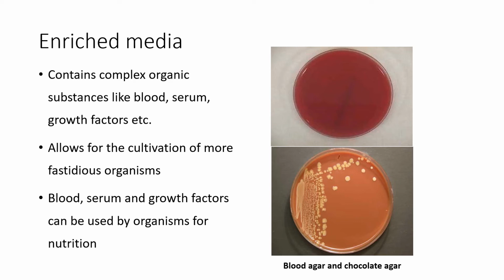We've got chocolate agar, which does not contain chocolate in it, but it does contain blood cells that have been heated and lysed to release the hemoglobin, and that's what makes it the color of chocolate. Blood, serum, and growth factors can be used by organisms for nutrition.